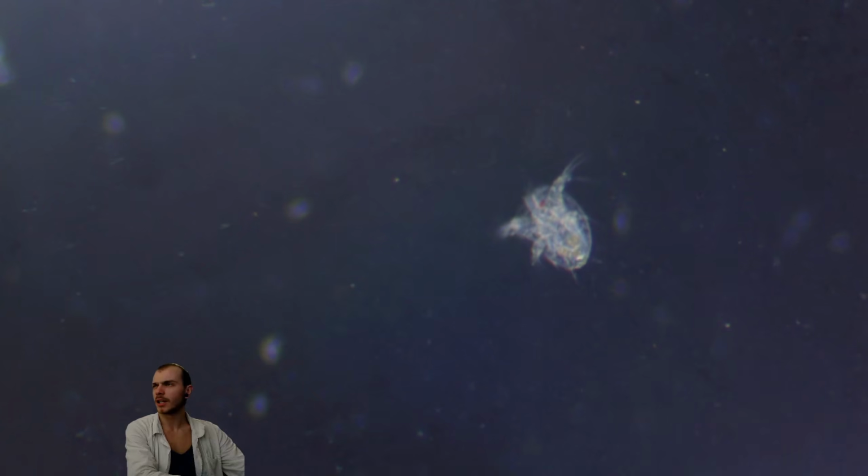So there is a possibility that there is no third ostracod. Probably there are just two ostracods and one Daphnia. But I remember that there was a really big ostracod at the start as we were observing this specimen.